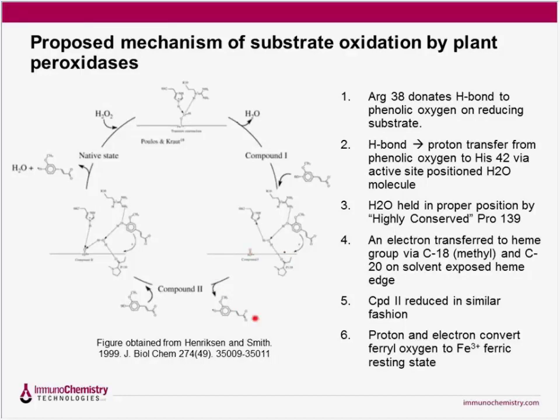When this occurs, the oxidized substrate gets ejected, and another unoxidized or reduced form substrate could reattach, and then the whole thing starts all over again, leaving the net result of you end up with 2 oxidized substrate molecules, and you end up with water. Now this also, because the enzyme has very high catalytic activity, this process all occurs really fast.